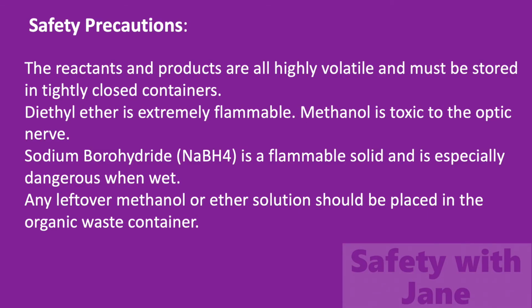And now, safety with Jane. The reactants and products are all highly volatile and must be stored in tightly closed containers. Diethyl ether is extremely flammable. Methanol is toxic to the optic nerve. Sodium borohydride is a flammable solid and is especially dangerous when wet. Any leftover methanol or ether solution should be placed in the organic waste container.